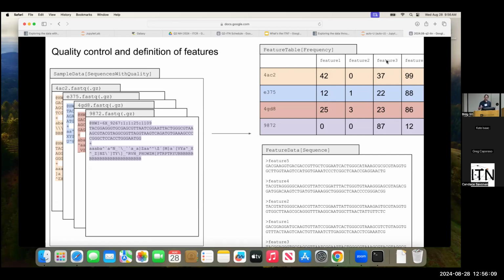There are some reasons for that I won't get into right now, but basically those identifiers are really not intended to be very useful for you. They're intended to be useful to map information across different files, so different types of information about these sequences. In this case, mapping to the sequences. And this table I mentioned is one of the artifacts that we started with yesterday.